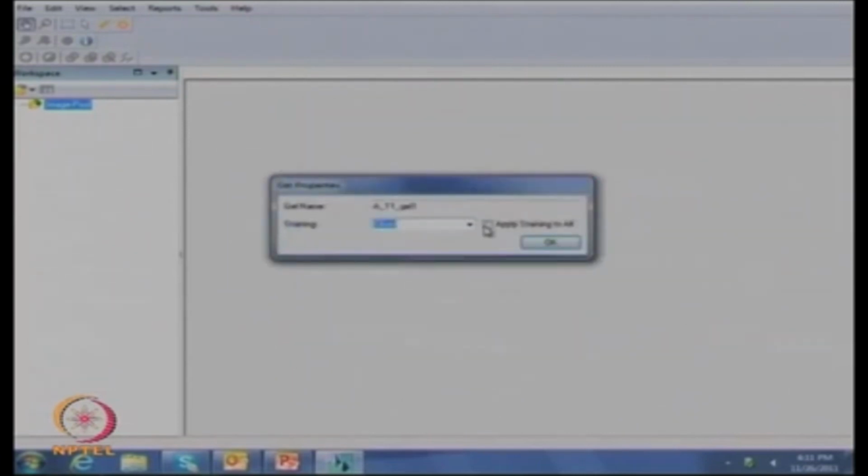So, you are processing 6 gels at a time. These are all the 6 gels. Basically, 2 sets of 3 replications, like 3 replications for each gel actually. Right. That means one is control and another is the treated in that way.